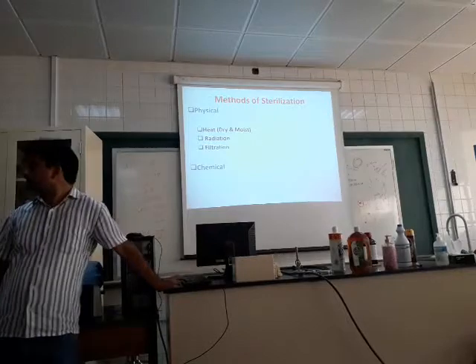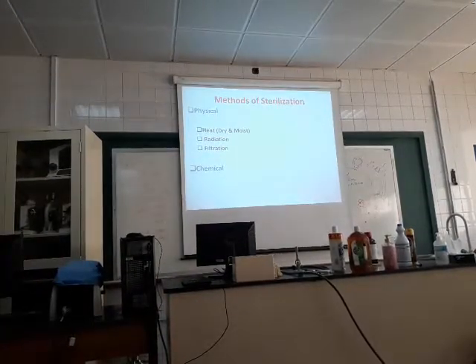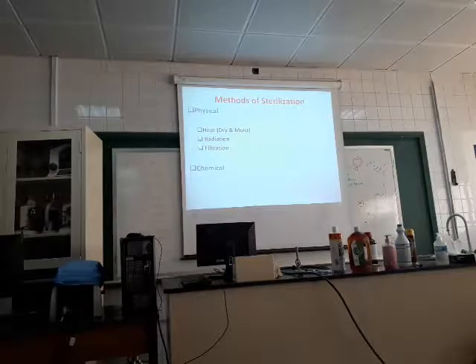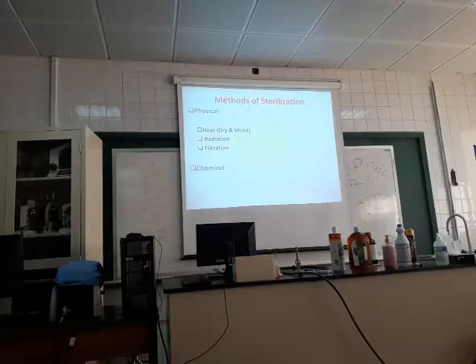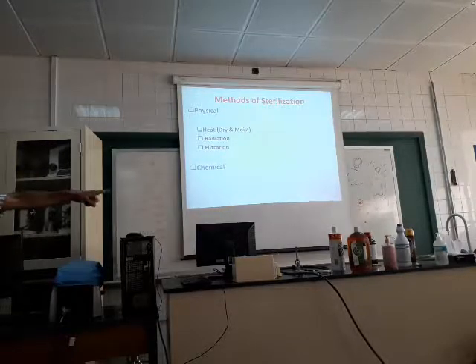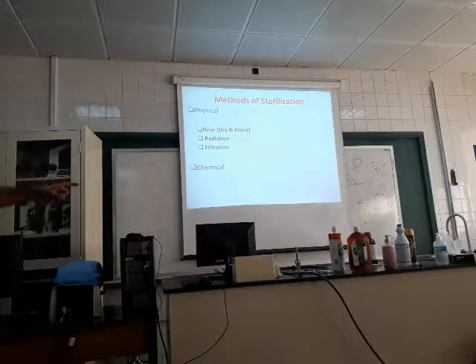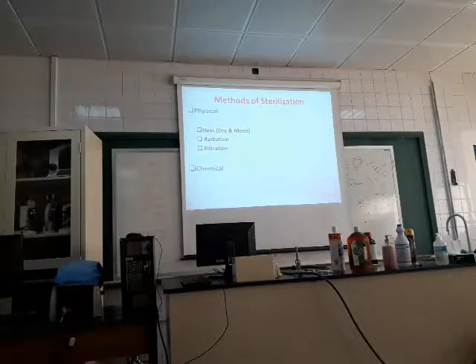If we subject the microorganisms to high pressure without changing the temperature, would it also be a method of sterilization? The temperature and the time are very important. I told you, this is 120 degrees Celsius for 15 minutes. If you keep it for 20 minutes, no problem, but at 15 you will get rid of all microorganisms. If you increase the temperature to 130, no problem, it will destroy them.